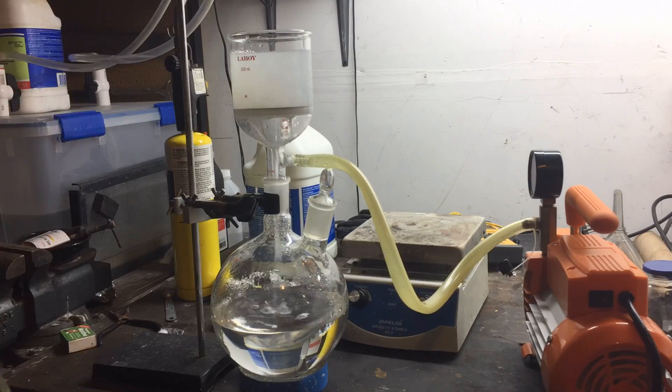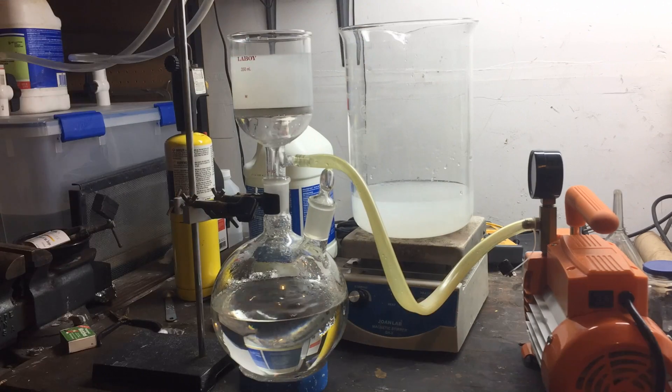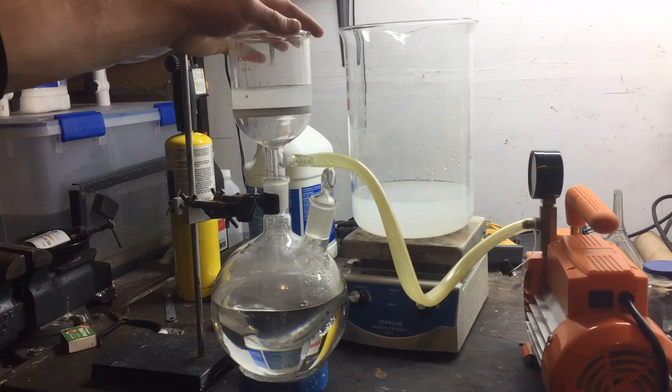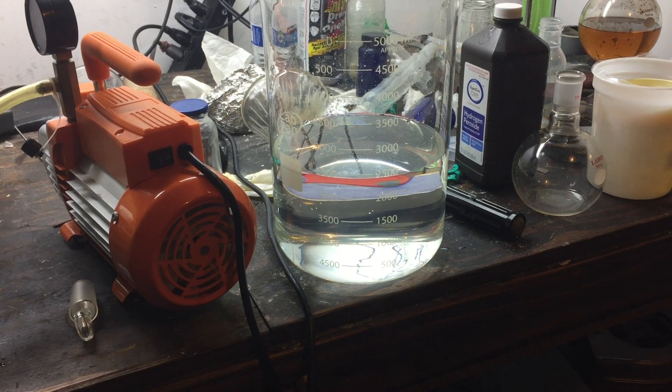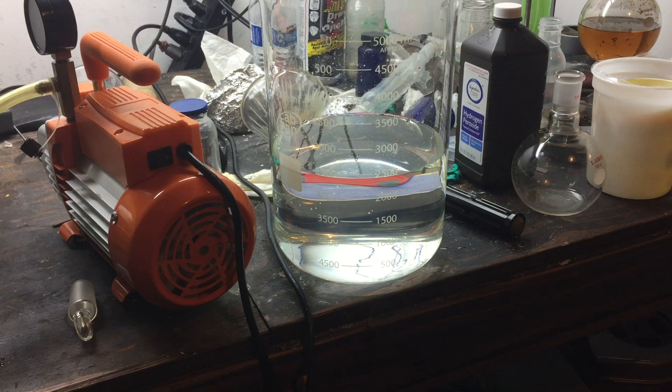I'm pretty sure that this contaminant is from the ammonium nitrate that I used, because it was initially a fertilizer, and there's still probably some trace amounts even though I recrystallized it. After the filtering, you can see that the solution was nearly crystal clear, and it was a lot better than what we started with.